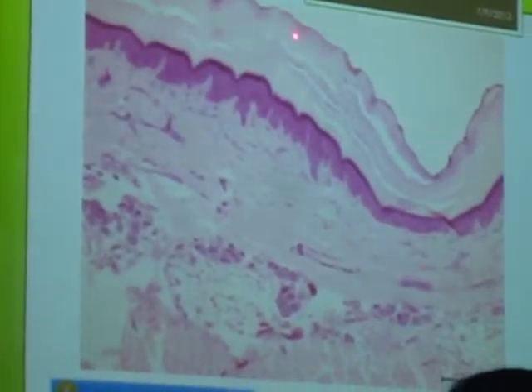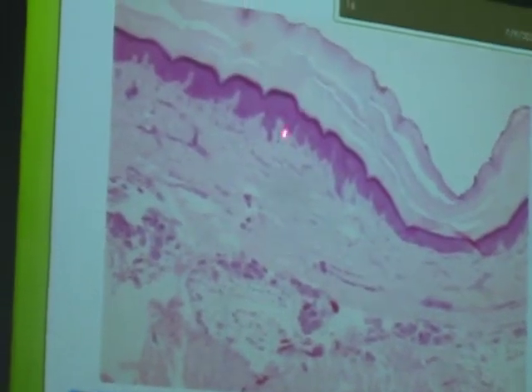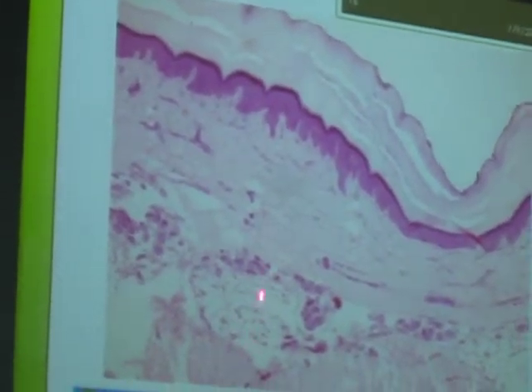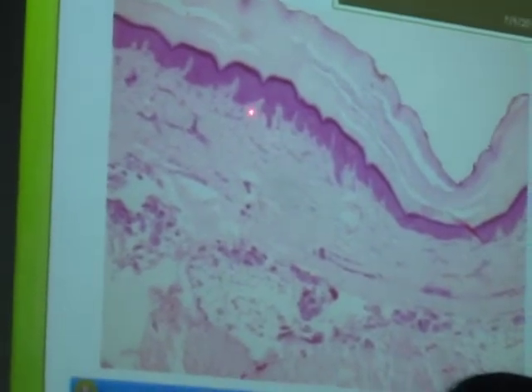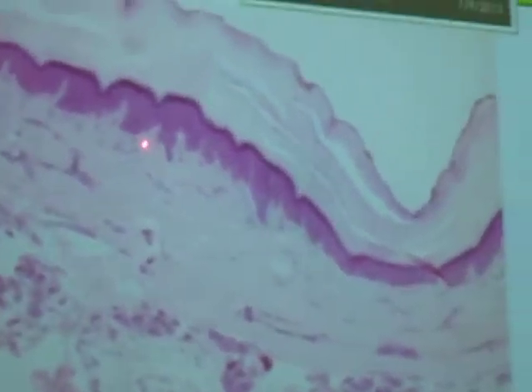What do you call the bracketed layer? Epidermis. How about this? Identify the bracketed layer. Dermis. Identify the bracketed layer. This layer only. Be specific. Dito this is the pointer. Identify the pointed layer. Be specific. This one.